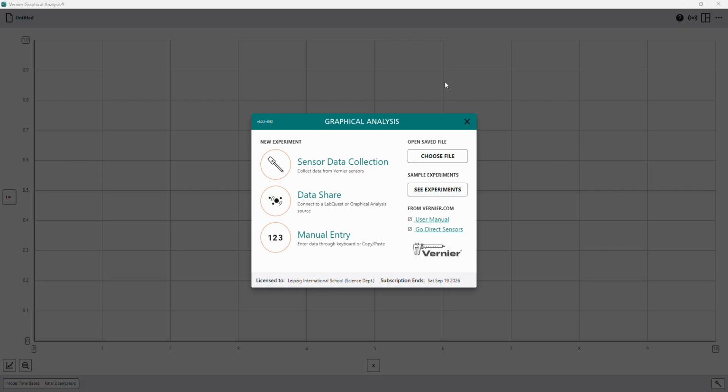You are free to choose whatever tool you want, as long as you're able to deliver what the lab report requires at the end. And you're highly encouraged to use the Vernier Graphical Analysis because it is a software that we have purchased as a school, and it is quite appropriate for the purposes of the IB physics program, also for chemistry and biology if you're interested.